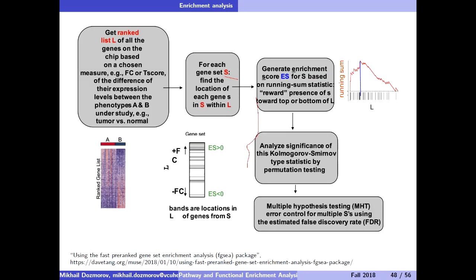But if you do some sequence similarity analysis, you may rank your genes by how similar they are by sequence, or whether they bind to a particular sequence, or are regulated by a particular microRNA, and you can rank them by anything you want. Again, it's just a matter of what kind of metric you choose to rank those genes. Then enrichment analysis will do the rest in terms of saying whether there is something special about your ranked gene list.